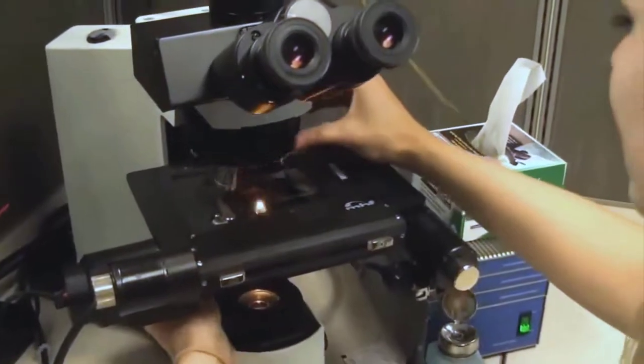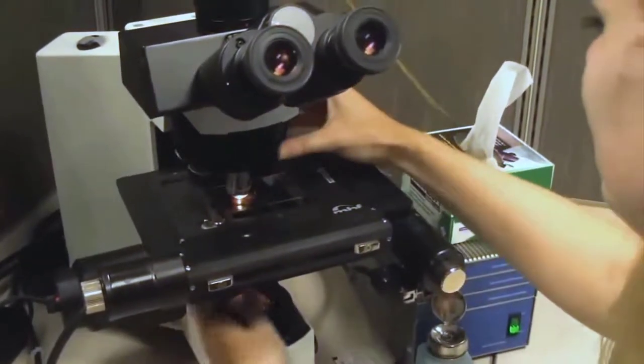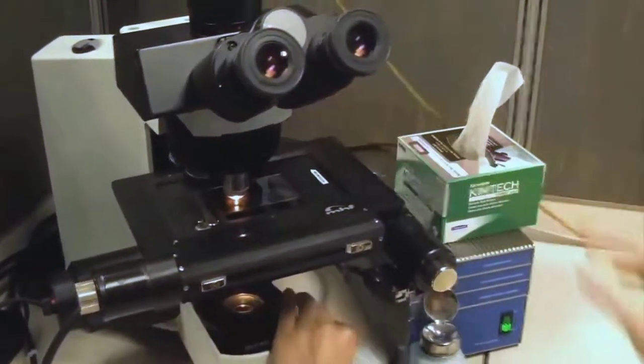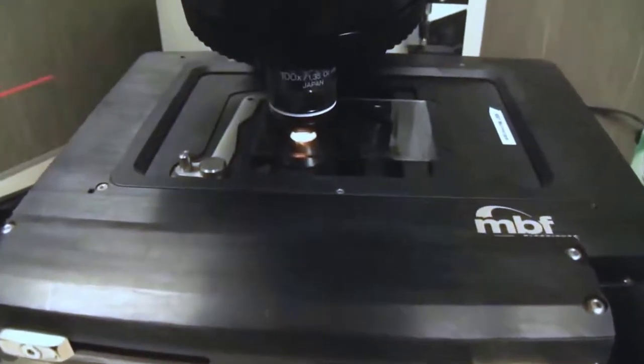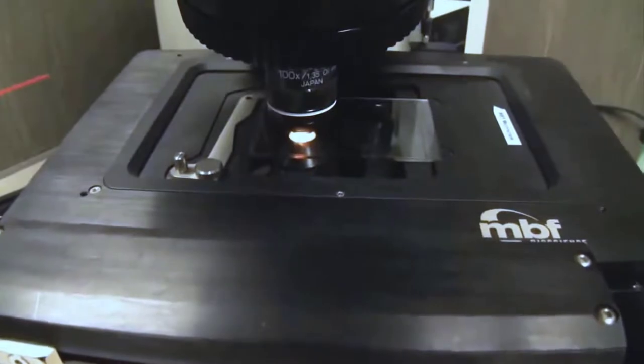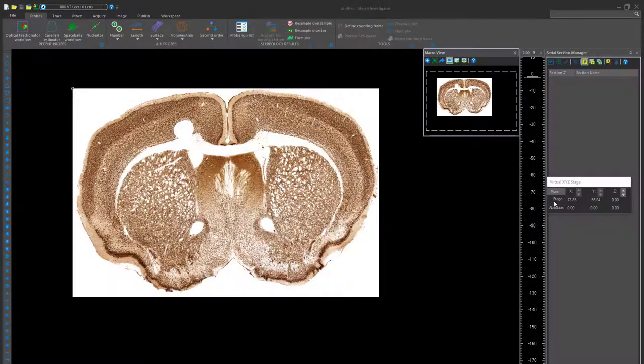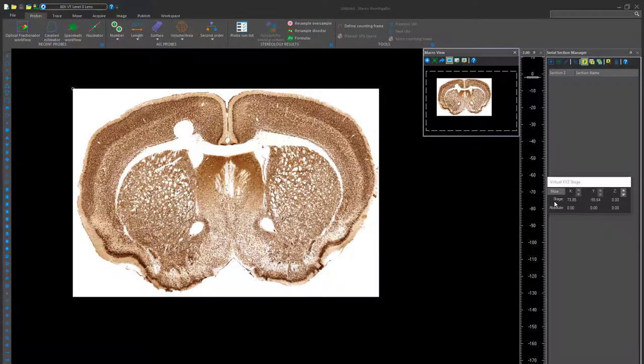With StereoInvestigator, you are able to receive the most proficient, precise, and unbiased estimates of cell populations, morphometric properties, and biological structures. Let's show you how it works. Each probe allows the researcher to unbiasedly estimate a specific piece of information pertaining to the tissue specimen.